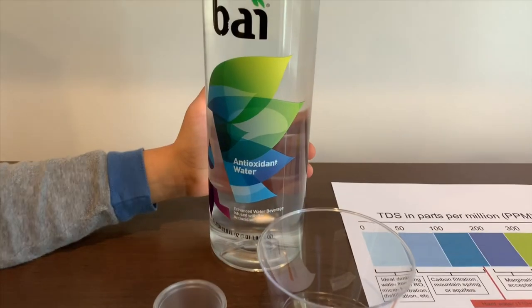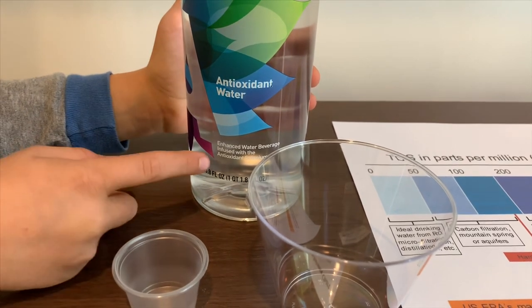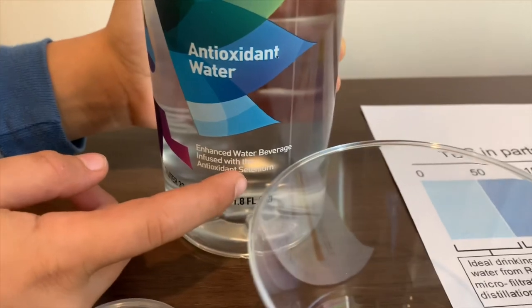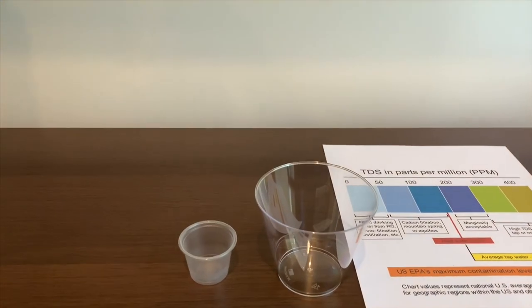This is Bai Antioxidant Water. It costs $1.67. It's infused with the antioxidant selenium. Let's test the pH and TDS level.